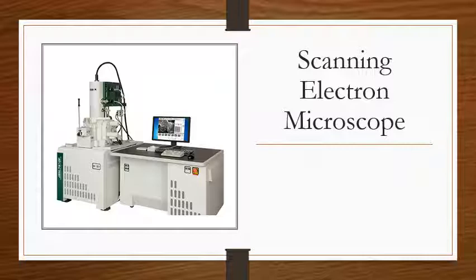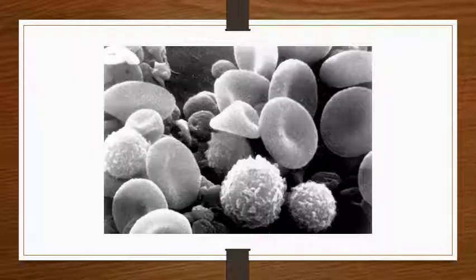We had not been able to see the surface of a cell prior to the invention of the scanning electron microscope. Now, both electron microscopes are way too expensive for a high school to own. I have heard of organizations that will loan scanning electron microscopes to schools, but I have not been able to get access to one of those. But these you would primarily see at major universities or research institutes.